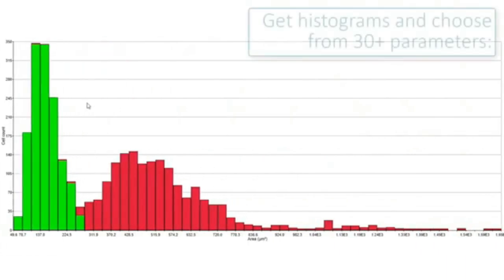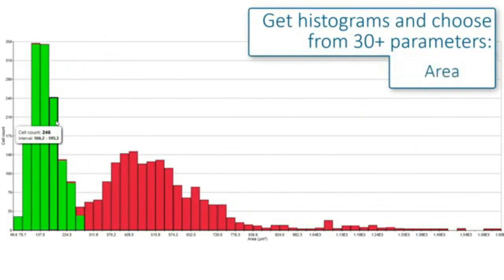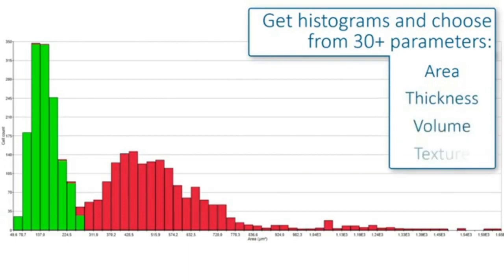You can also view your results in a histogram. Here, the cell area is depicted, but you can choose from more than 30 different morphological parameters, including thickness, volume, texture, and irregularity.